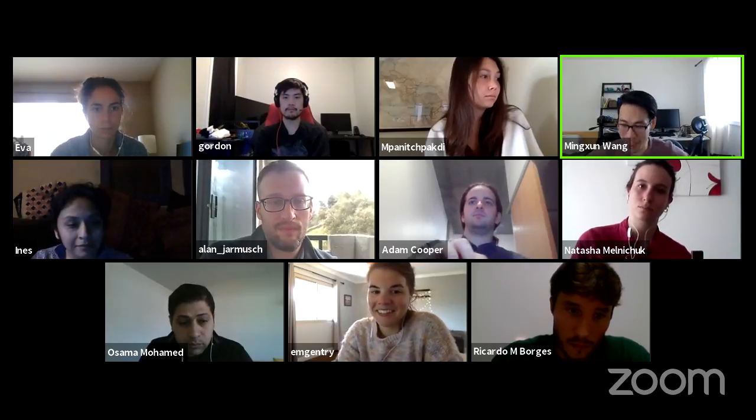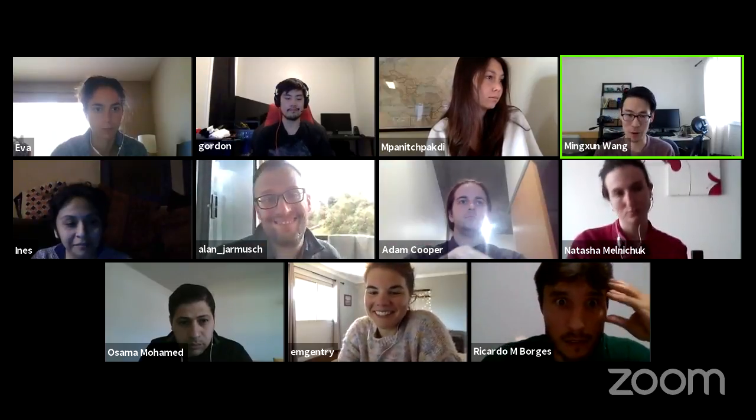One of the things we also wanted to ask you about is we have way too many tools now in GNPS. People in Peter's lab don't even know a lot of them. So don't feel so bad if you're like, I don't know what's going on here.